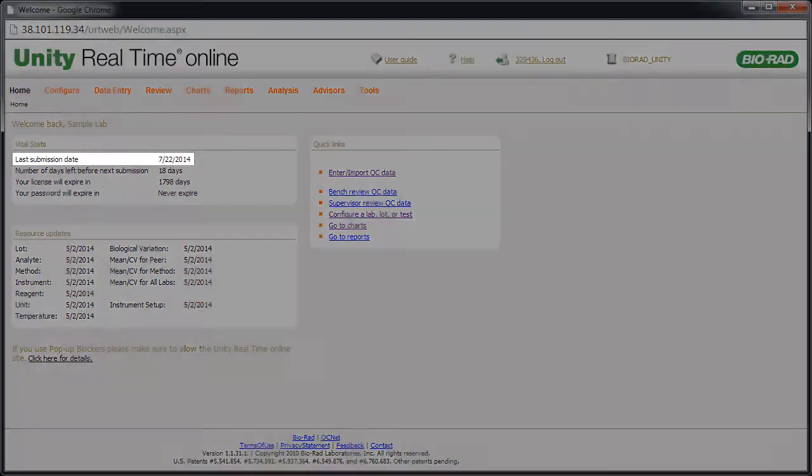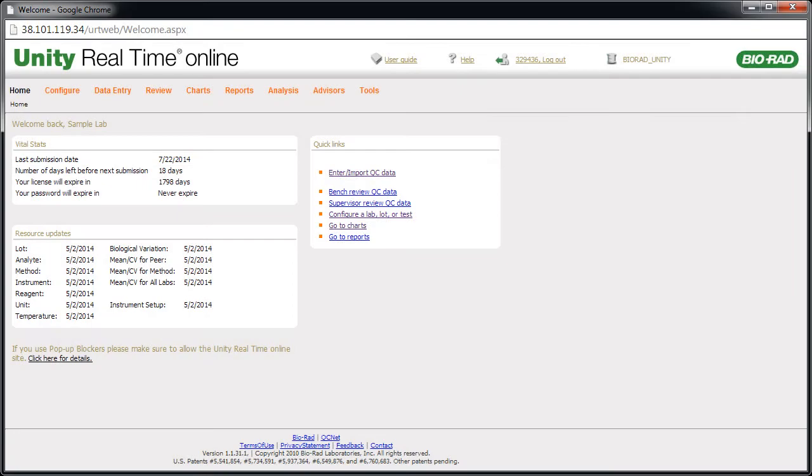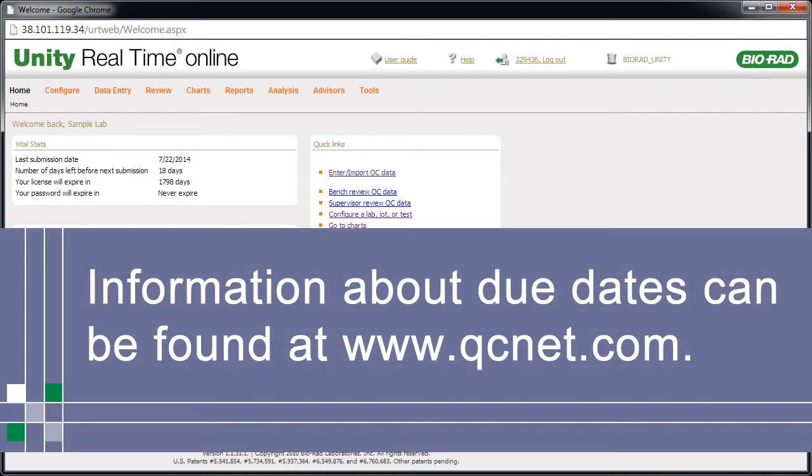Note that your home page shows the date of your last data submission. Information about due dates can be found at www.qcnet.com.